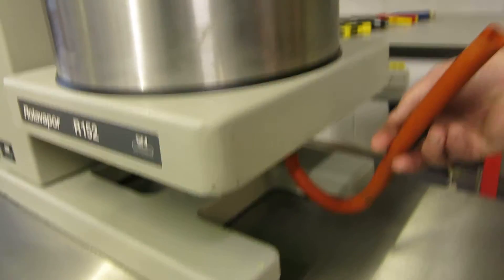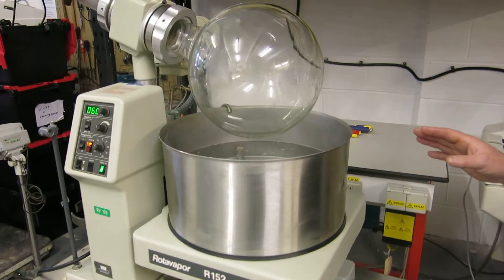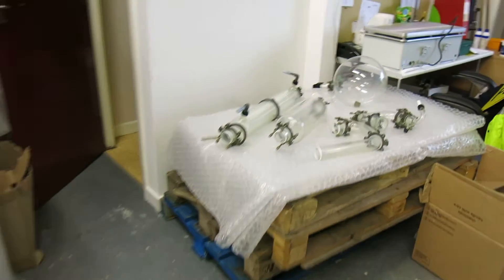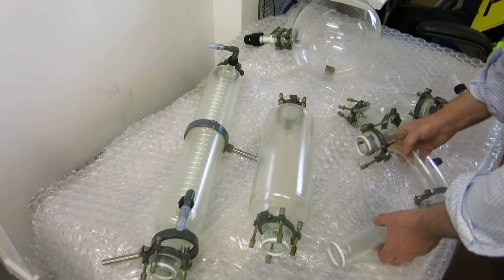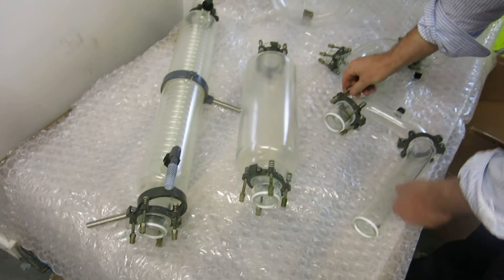There is a valve at the bottom of the bath so you can clear and purge the water out, though we obviously won't do that now because it's 57 degrees. We're now going to come over and have a look at the glassware that's been laid out on the pallet, so you can see that it's all intact and in good order.